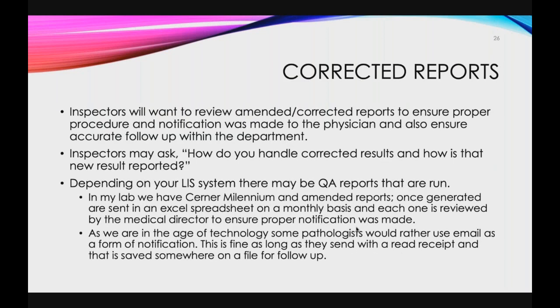Corrected reports. Inspectors will want to review amended and corrected reports to ensure proper procedure and notification was made to the physician. They may ask you, how do you handle corrected reports and how is that new result reported? Depending on your LIS system, there may be QA reports that are run. In my own lab, we have Cerner Millennium, and amended reports are generated on a monthly basis and sent to me for review by myself and my medical director to ensure that proper notification was made and that it's documented.